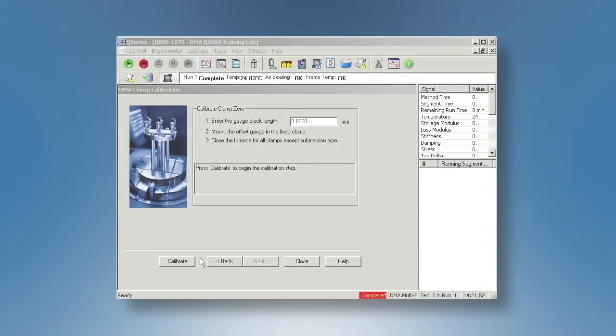For clamp zero calibration, enter zero as the gauge block length, then click on Calibrate.